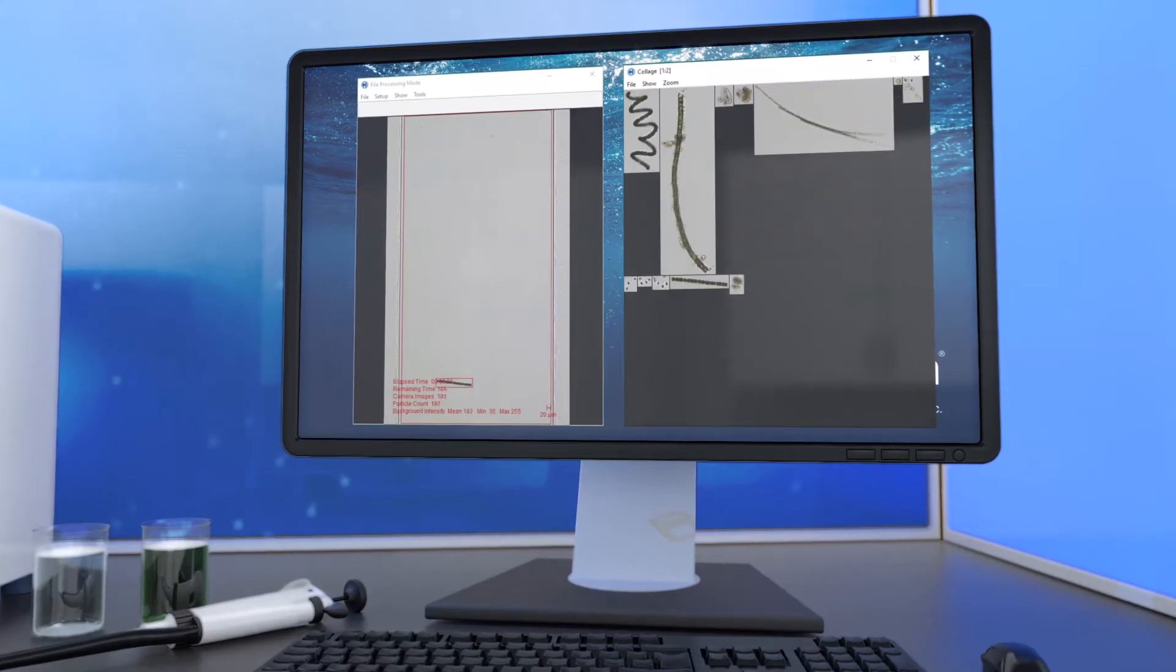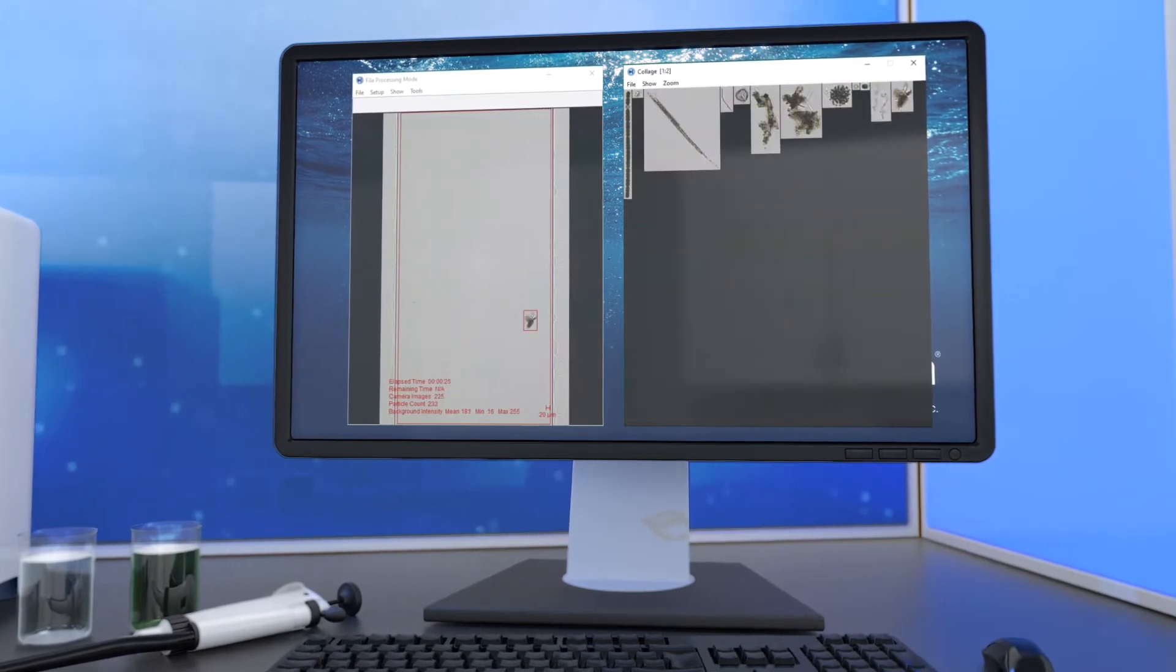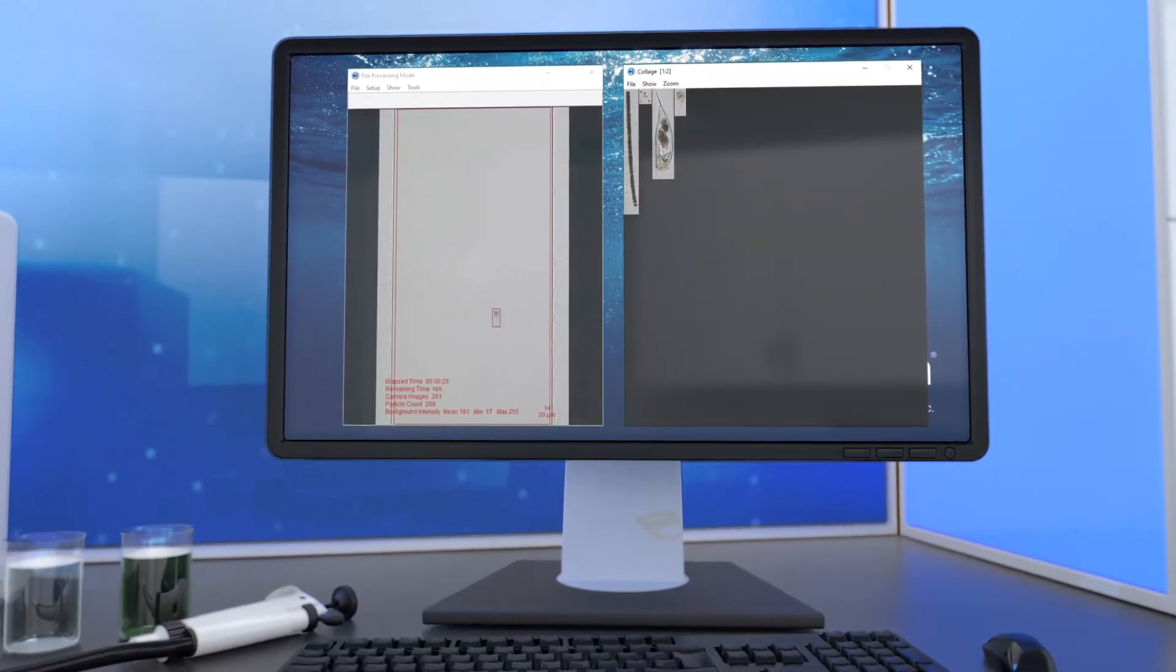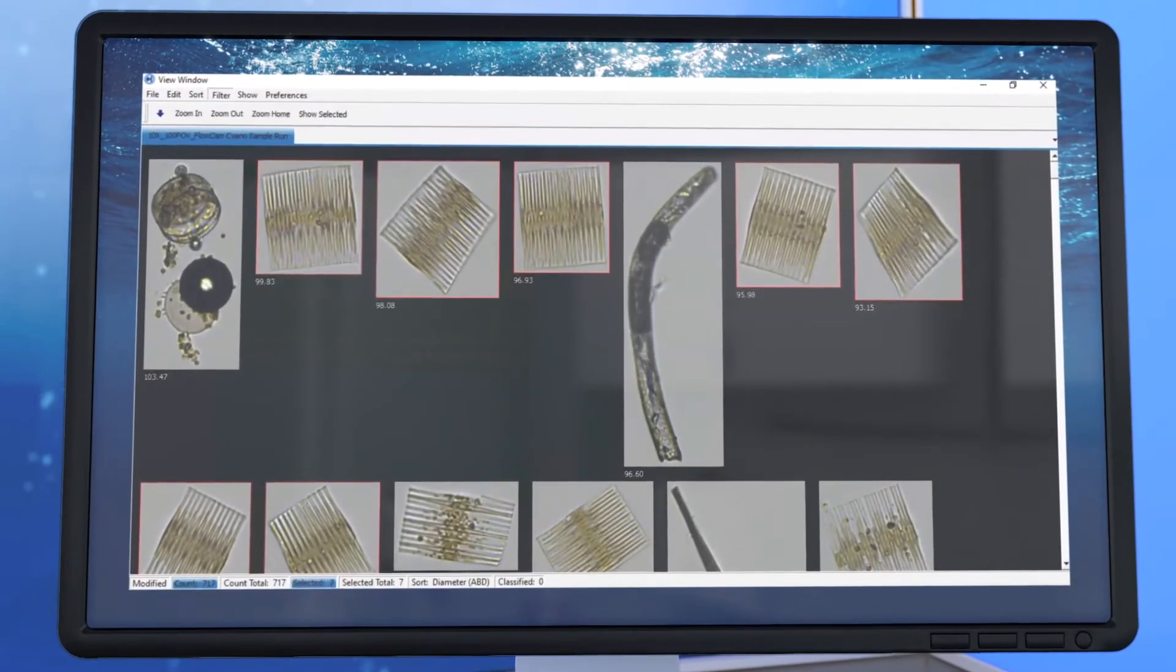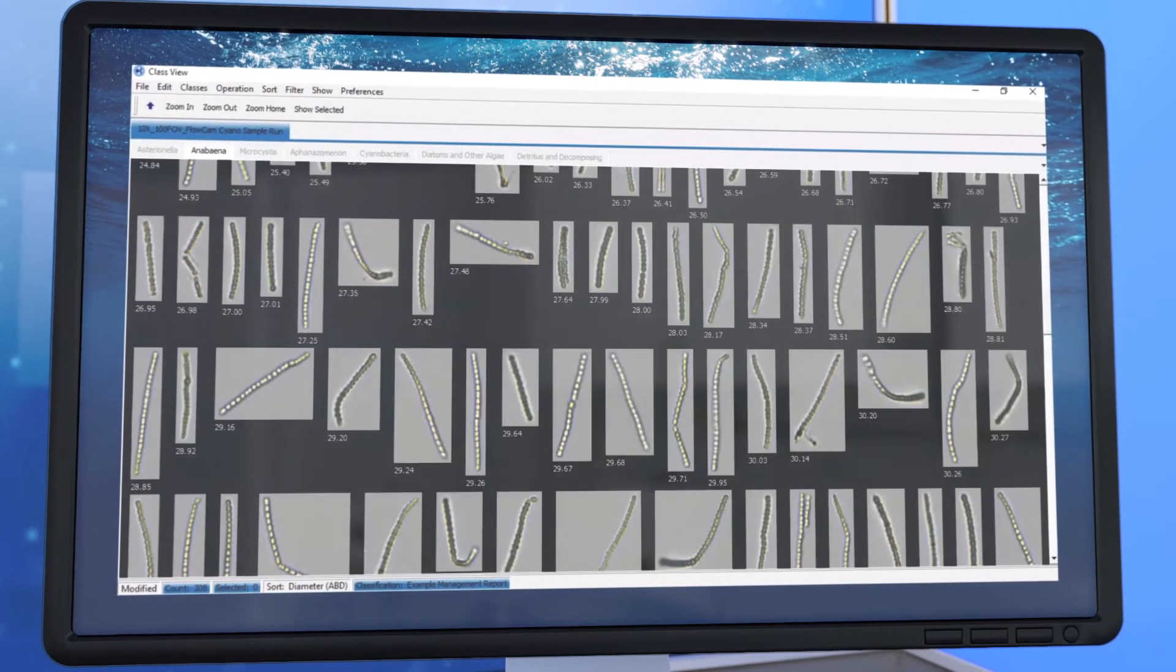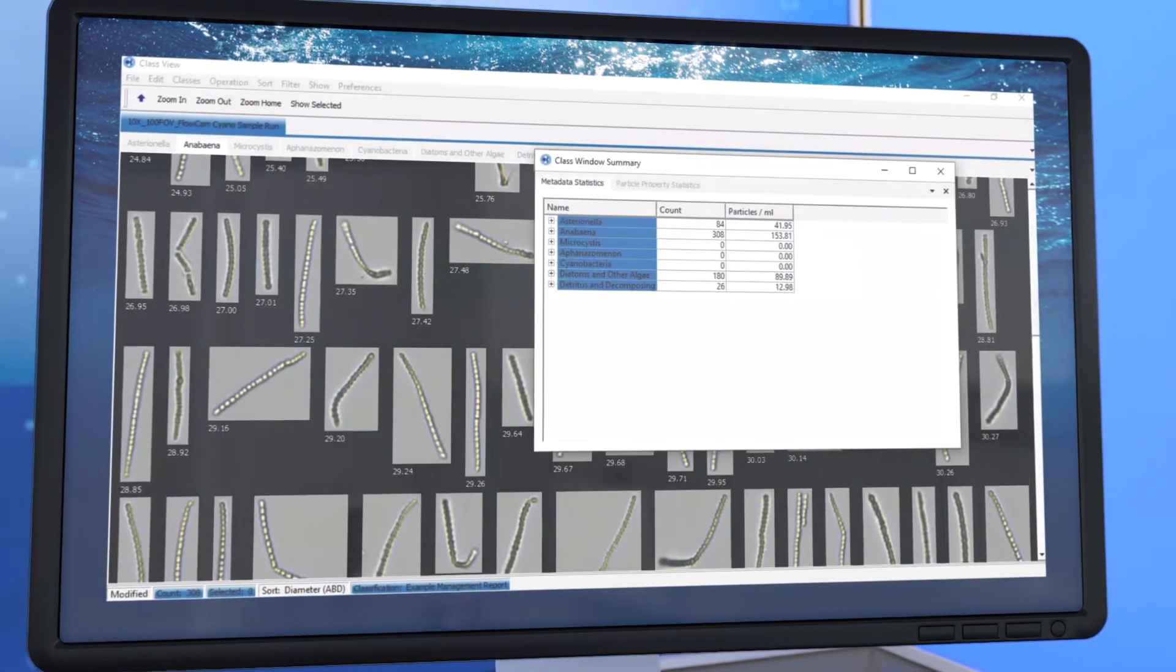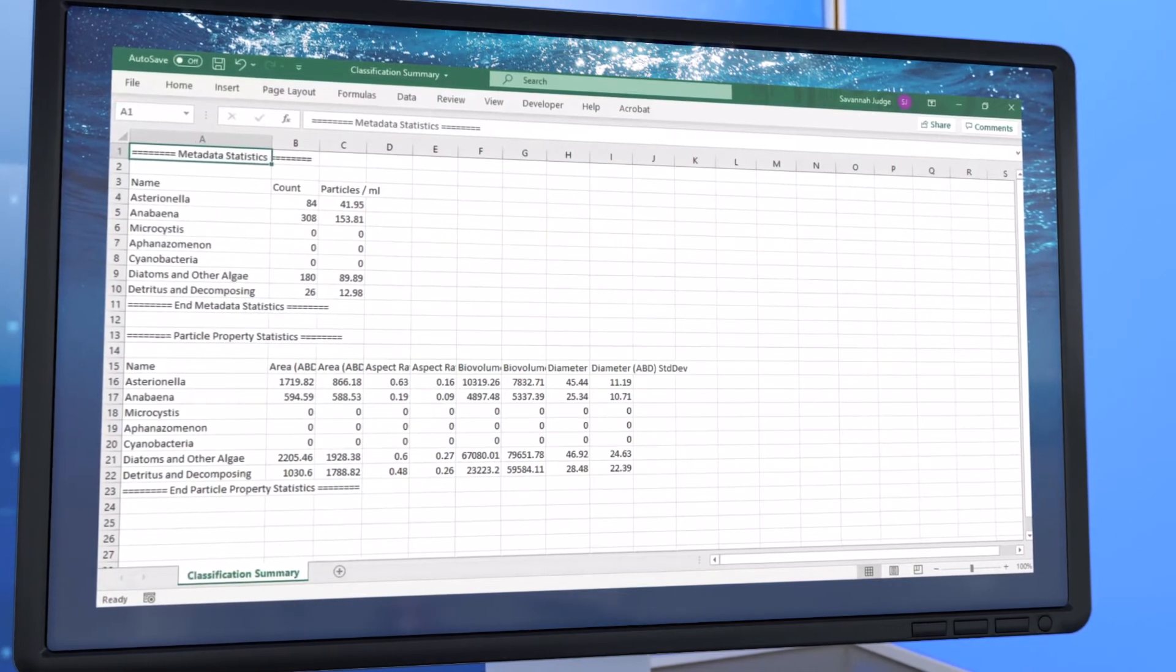In real-time, the FlowCam's software Visual Spreadsheet automatically separates and catalogues the images of each organism. Using built-in image recognition tools, users can classify organisms, estimate bio-volume, count cells, and calculate the abundance of each taxonomic group.